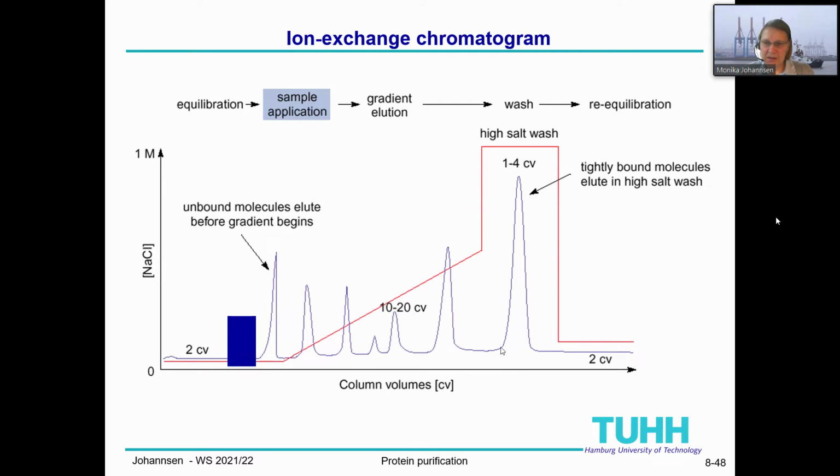Finally at the end we need to change the properties, for example, by having very high salt concentrations, so that everything that was bound to the matrix will be washed out. And then we need some re-equilibration before we can again inject the sample.